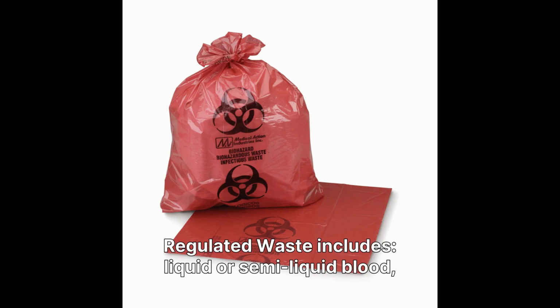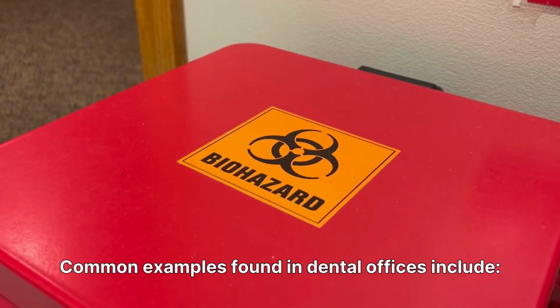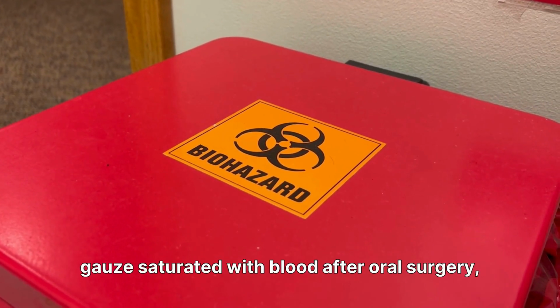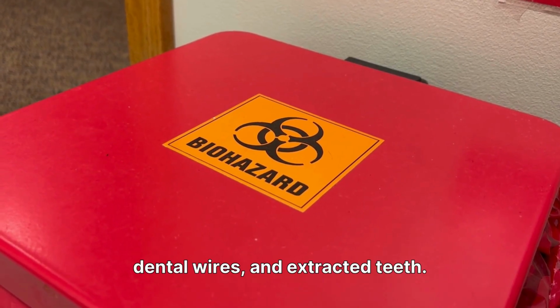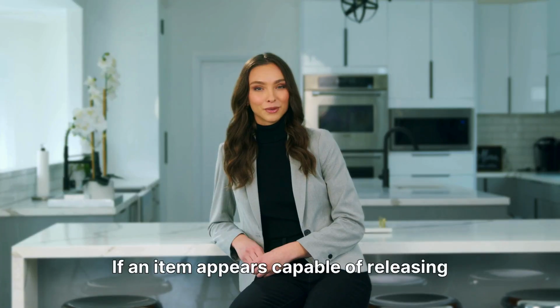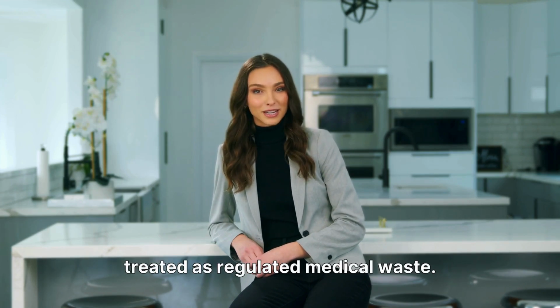Regulated waste includes liquid or semi-liquid blood or other potentially infectious materials, also known as OPIM. Common examples found in dental offices include gauze saturated with blood after oral surgery, dental wires, and extracted teeth. If an item appears capable of releasing blood or infectious material, it must be treated as regulated medical waste.